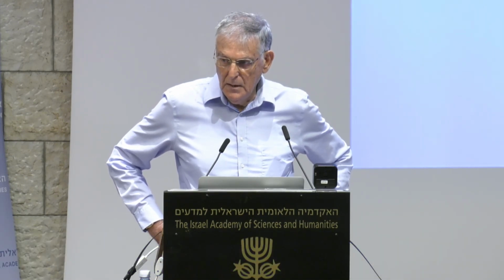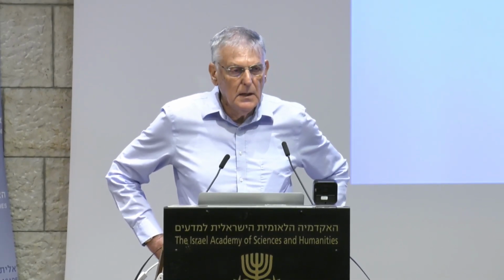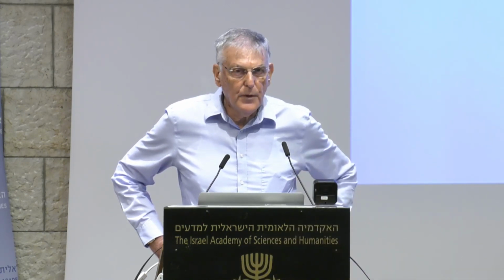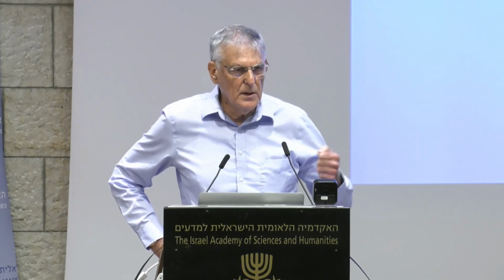Urban of Germany. I met him 32 years ago in Les Houches in France, and we are friends ever since. He has visited Israel multiple times, gave talks here, and he's the man of the world. He and his colleagues overcame the problem of spherical aberrations in electron microscopy. This was a major, major obstacle. While spherical aberrations were corrected in optics many, many years ago, no problem, in electron microscopy this was an obstacle.